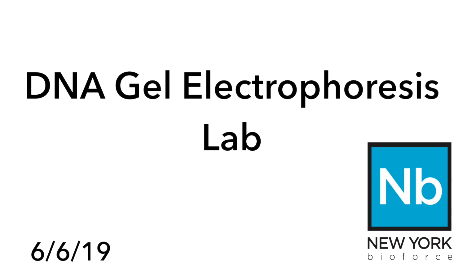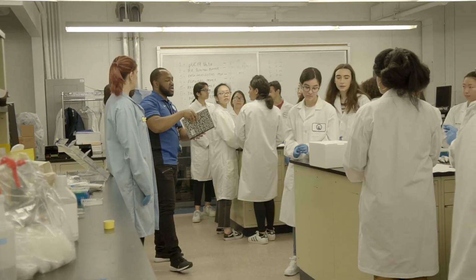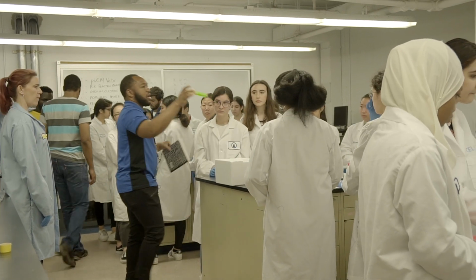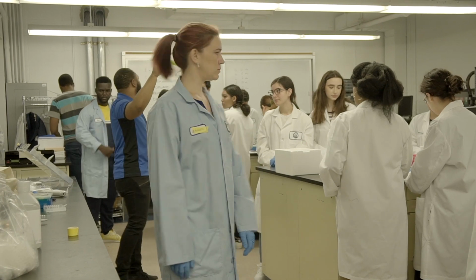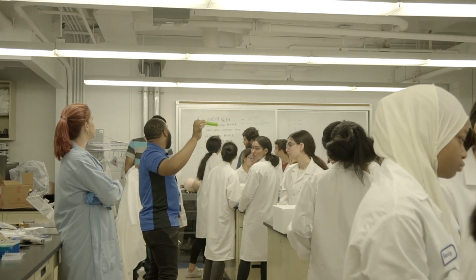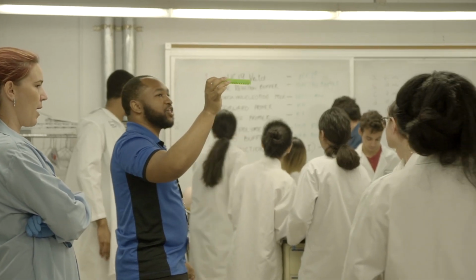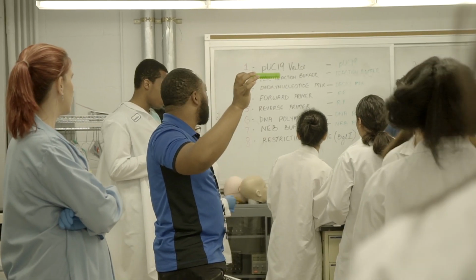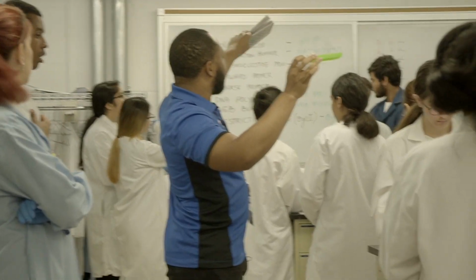Okay, so each of the three tables has 8 tubes already labeled and sitting in some type of holder, okay? Each of these 8 things corresponds to the 8 things you see on the board. Because they're very small, I had to abbreviate some of them, so the green on the right side is what is actually on your tube, and the black is the full name, so you can follow on your procedure as well, okay? The calculations in number 2, the correct answers are on the board.